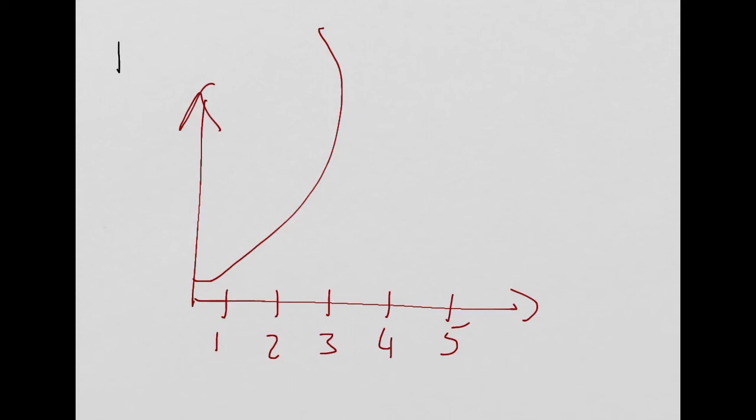It took me 2 hours to figure out what was wrong with that. And I felt like Sherlock Holmes. What he put down on the x-axis was not the concentration of his standard substance. What he put down was the tube numbers.